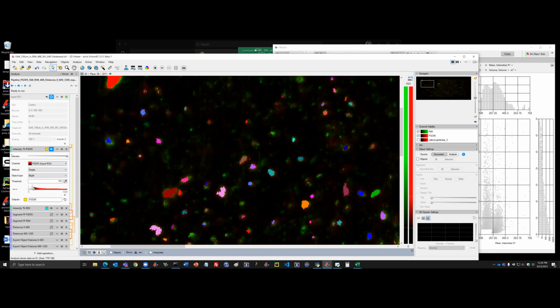The reason we are using intensity threshold in this example is that the shape of the particles is often non-round, and even though they would be perfectly identified with the blob finder as well, their shape might be distorted. And because we want to measure the distances and the volumes of those particles, it's important to preserve their shape as well.